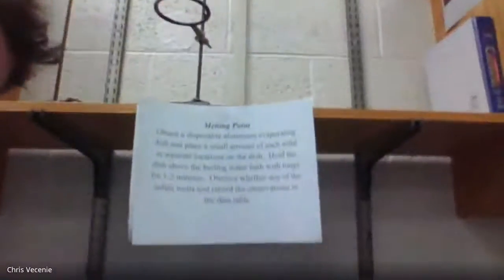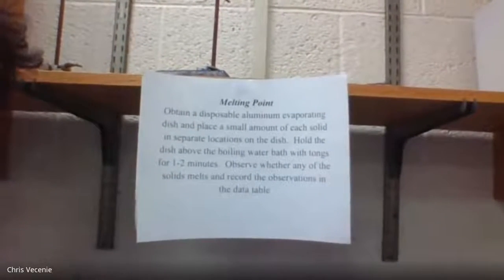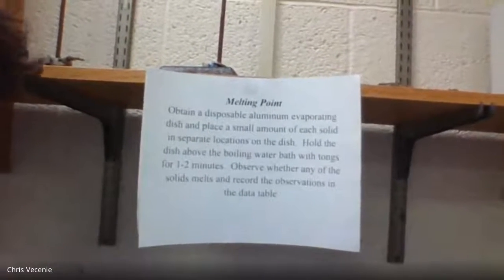All right, so the first one here, each of these signs that you see is attached to your data table document that I shared with you. All right, so you guys can see what these are, right, but it's just telling you how to conduct the tests.